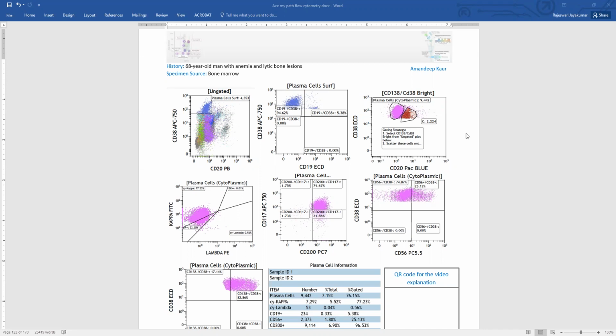So most labs do not even perform a regular full myeloid and lymphoid panels for cases where they suspect plasma cell neoplasms. They just run the plasma cell tube and then they will correlate it with the morphology and release the report. So this is one such case where they just did the plasma cell tube, because you have your bone marrow morphology, and if you see plenty of plasma cells, then that's probably enough to do for flow.